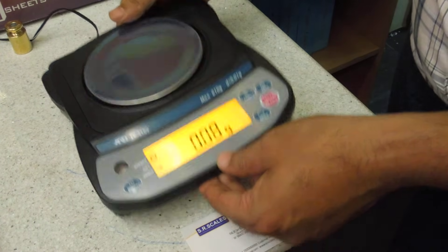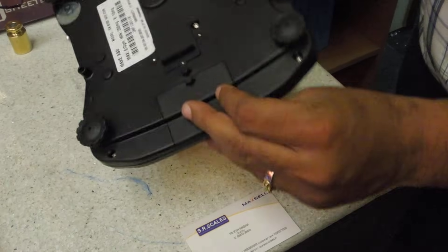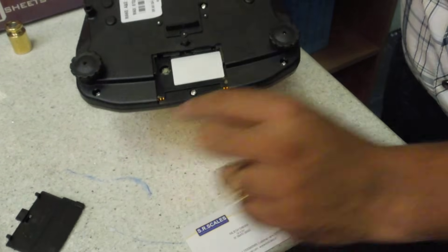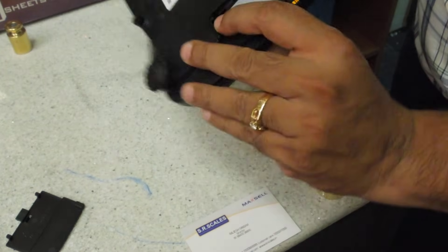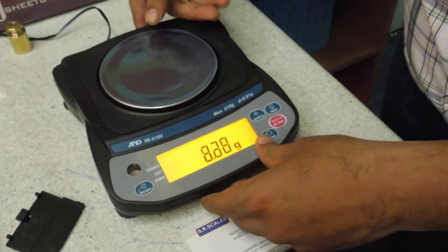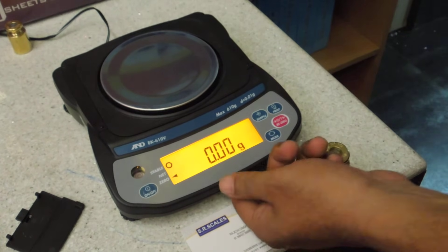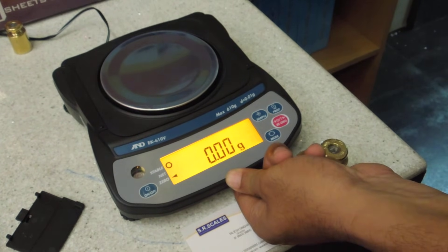For that, you have to turn the balance and remove the cap. Here is the button which you have to press. Press for 2 seconds.